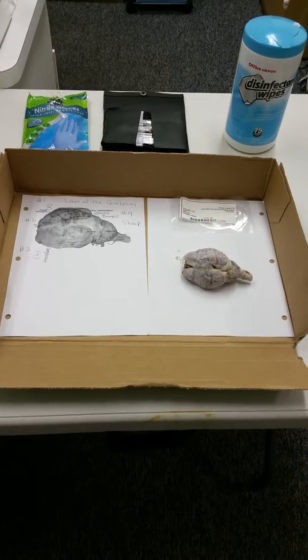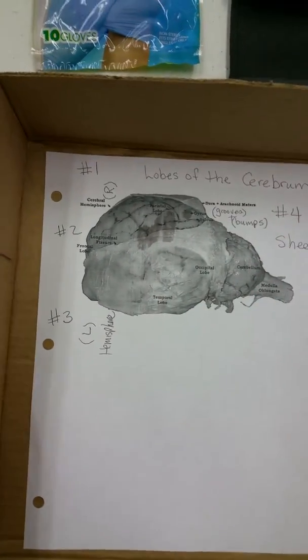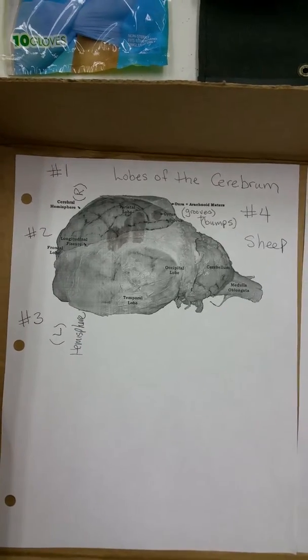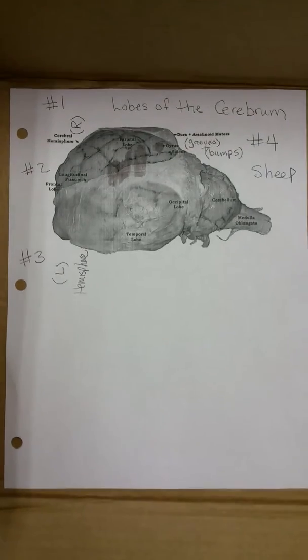We have the real sheep brain on the right. And then we also have a picture of the sheep brain so that when we are pointing to it, it gives us a good perspective and also a point of reference.